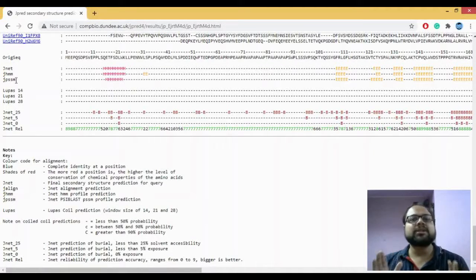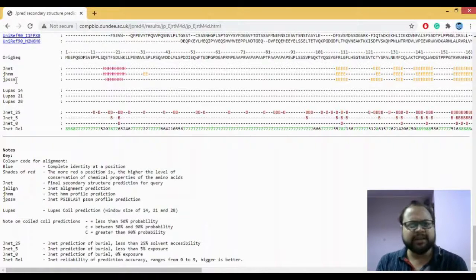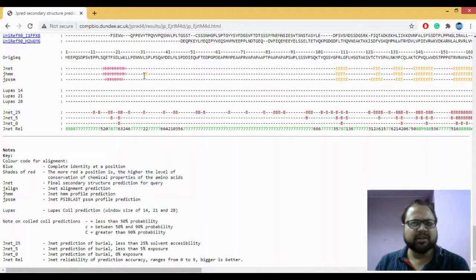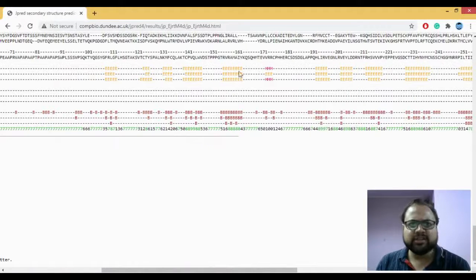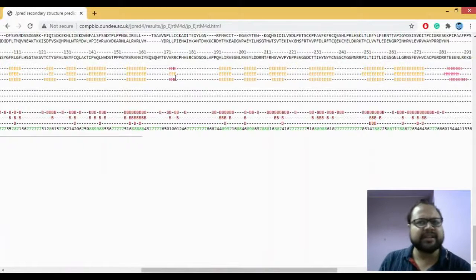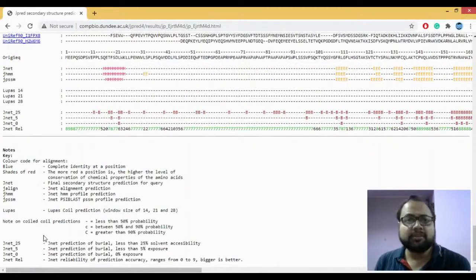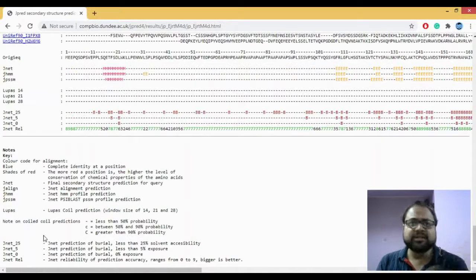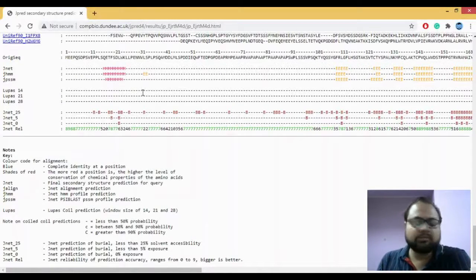Looking at all the possible results shown, if you look at the sequence overall — it's showing helix in this region correctly, and beta sheets in these sections. There's a slight difference where HMM has predicted turns and helix differs slightly, but for most regions it's predicting correctly, and the coils are the same across all three methods. I'd say JNet is the best.